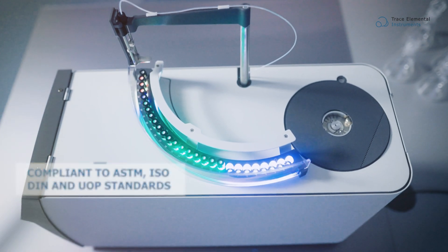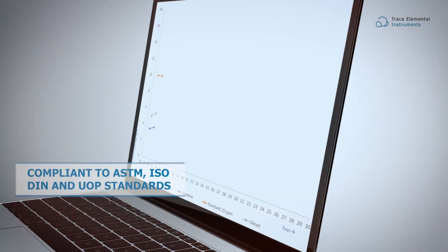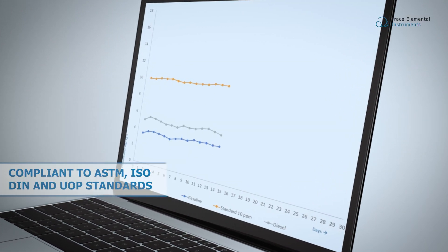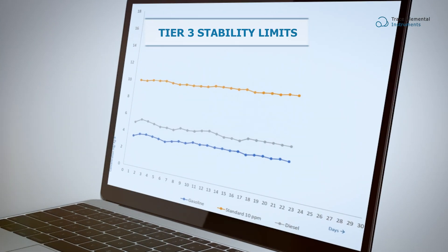The Explorer V analyzer is compliant with all relative ASTM, ISO, DIN, and UOP standards, and reaches stability limits as stated in Tier 3 demands.